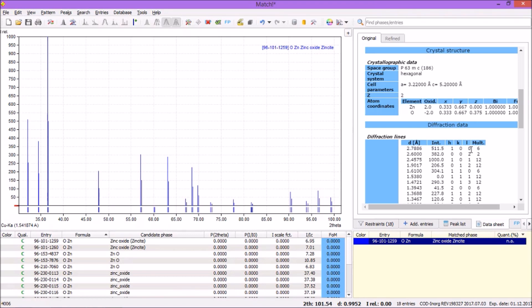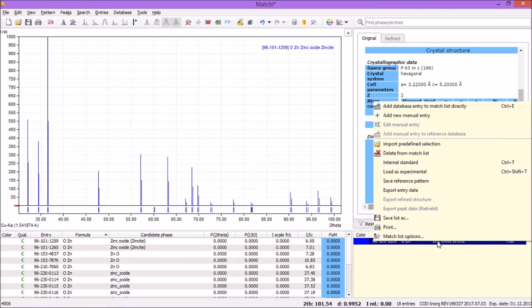It's pretty easy. In this sheet you can find the two theta values as well as the d-spacing. So let's see how to do that. It is pretty easy, just right click on it.